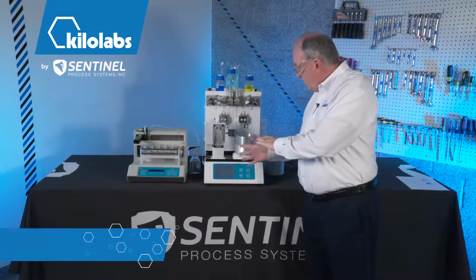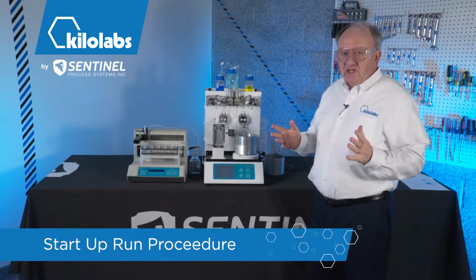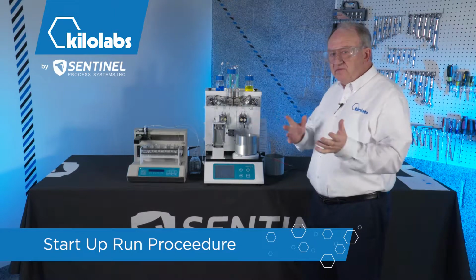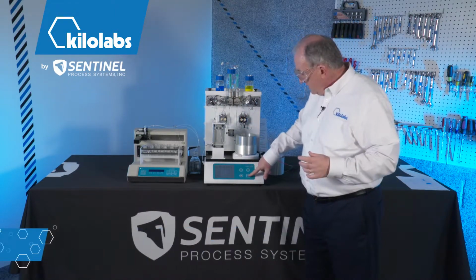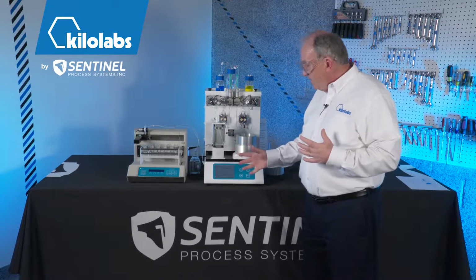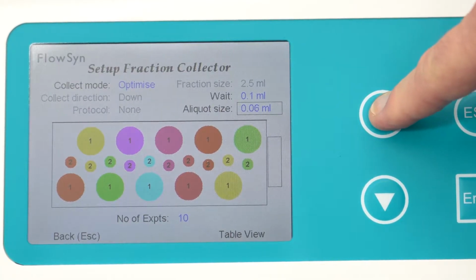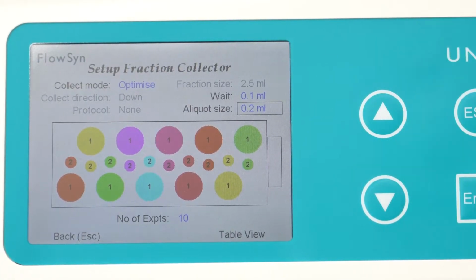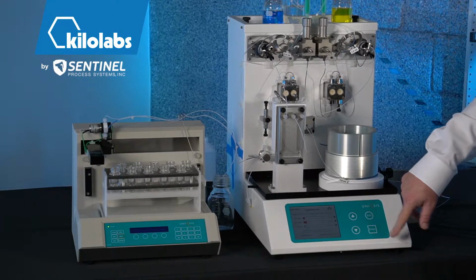We've gone through the multiple experiment table, and now we're going to actually run the machine. In running the machine, you're going to see the fluids actually go through the mixing chip and the coil. So I'm going to come over here. I hit the start button, and the start button brings up a configuration screen for the fraction collector to make sure that it's oriented correctly. And then the last button is start experiments, and in essence this commits everything to the start.